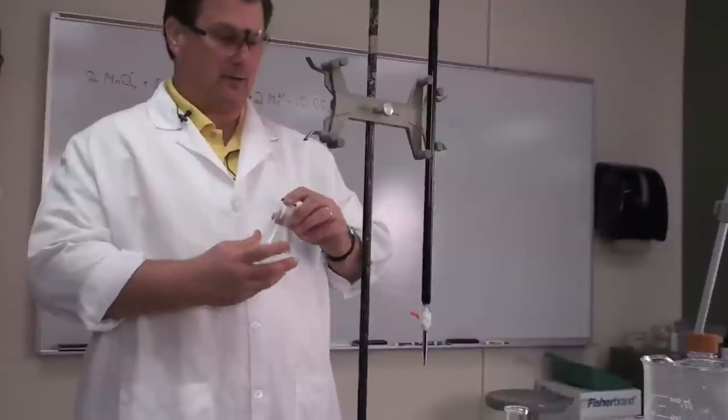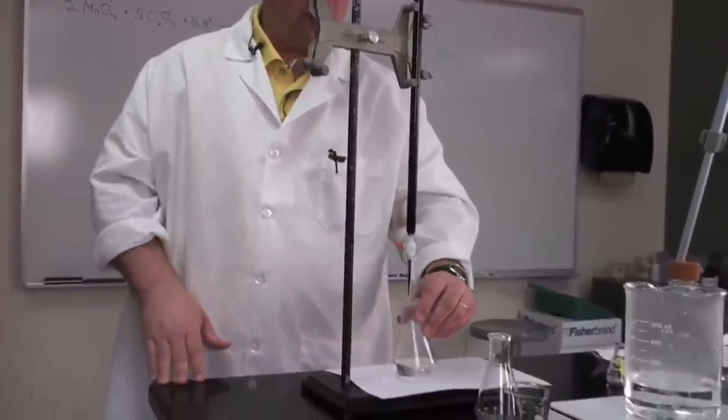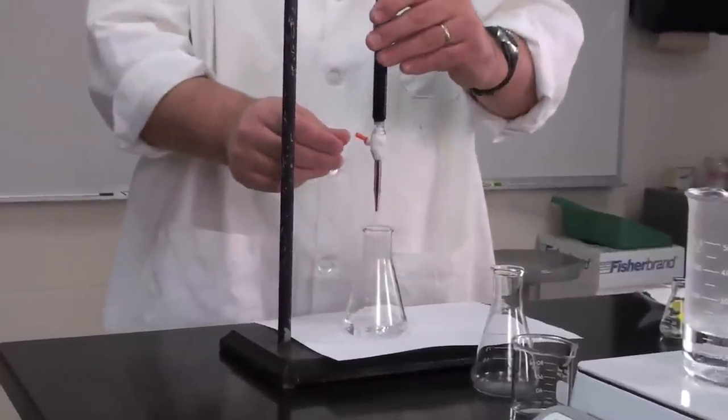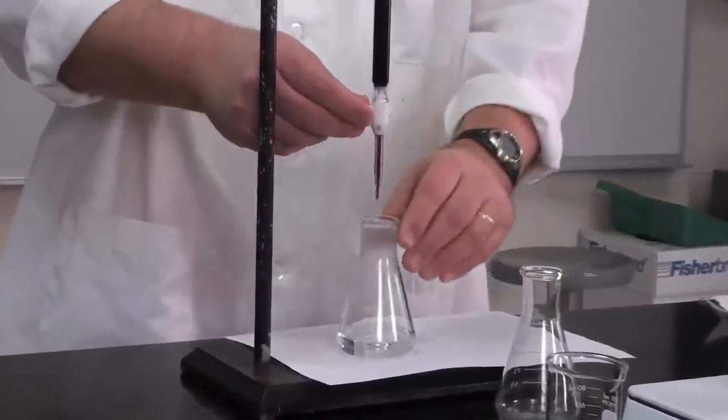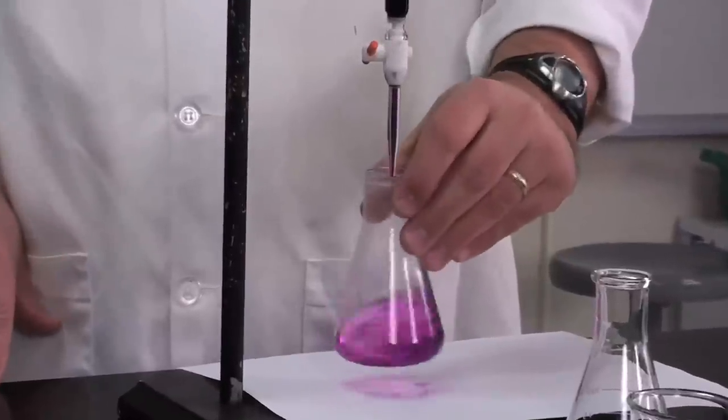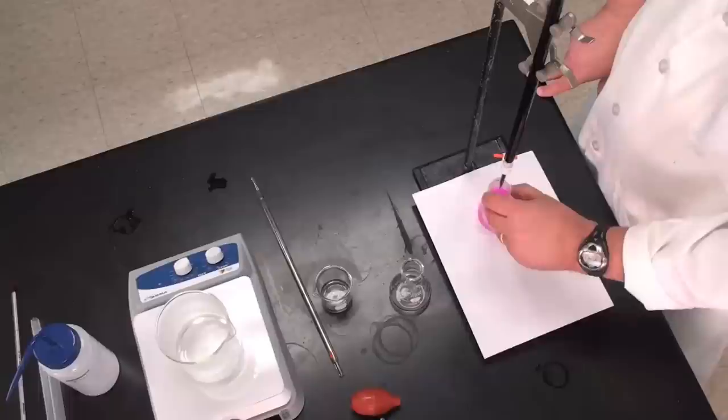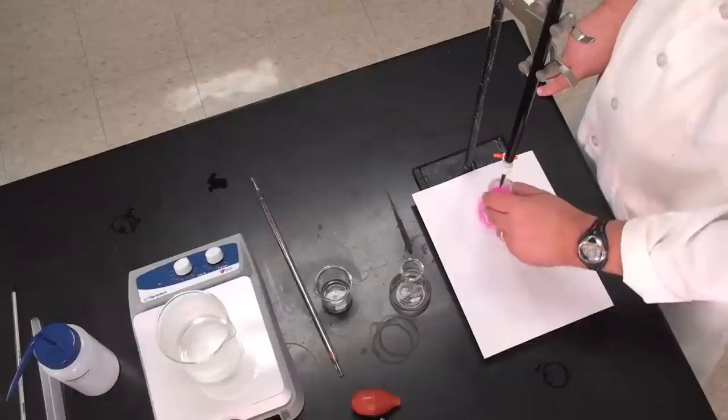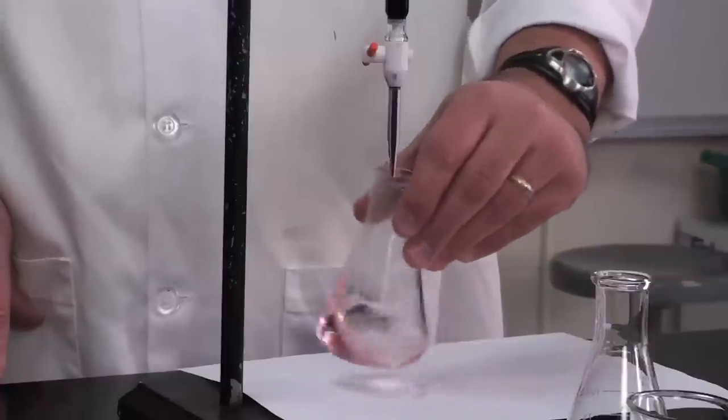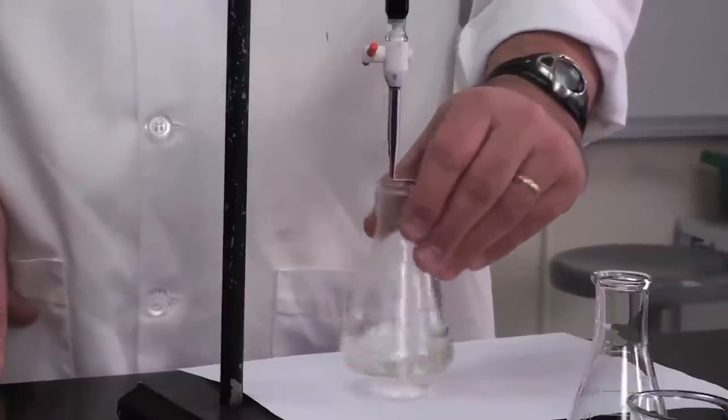Now let's begin our titration. We've got the initial volume, we've got our oxalate solution heated, so we can start. I'm going to add a little bit at first, swirl it. Notice the pink persists for just a little bit, but it's going to go away. The color that is. And there it goes.